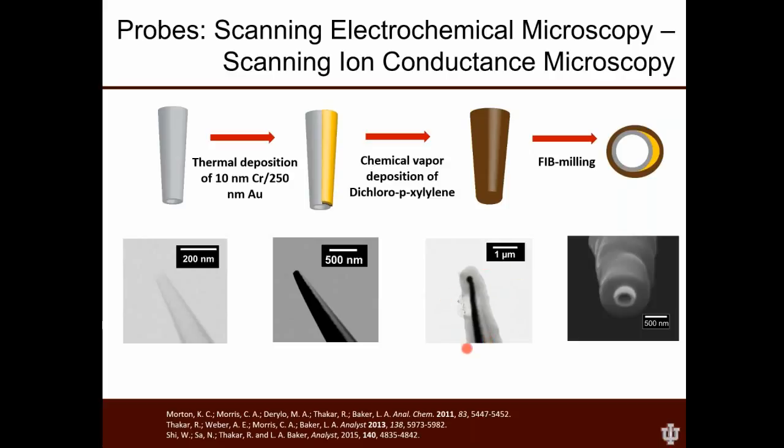So now we take this assembly and we move the pipette into a focused ion beam. And what a focused ion beam lets you do is essentially do nanoscale sculpting. With the nanoscale sculpting, what we can do is essentially chop off the end of this tip. So we can cut the tip here at the end and expose this gold layer. So now we have a central pore.